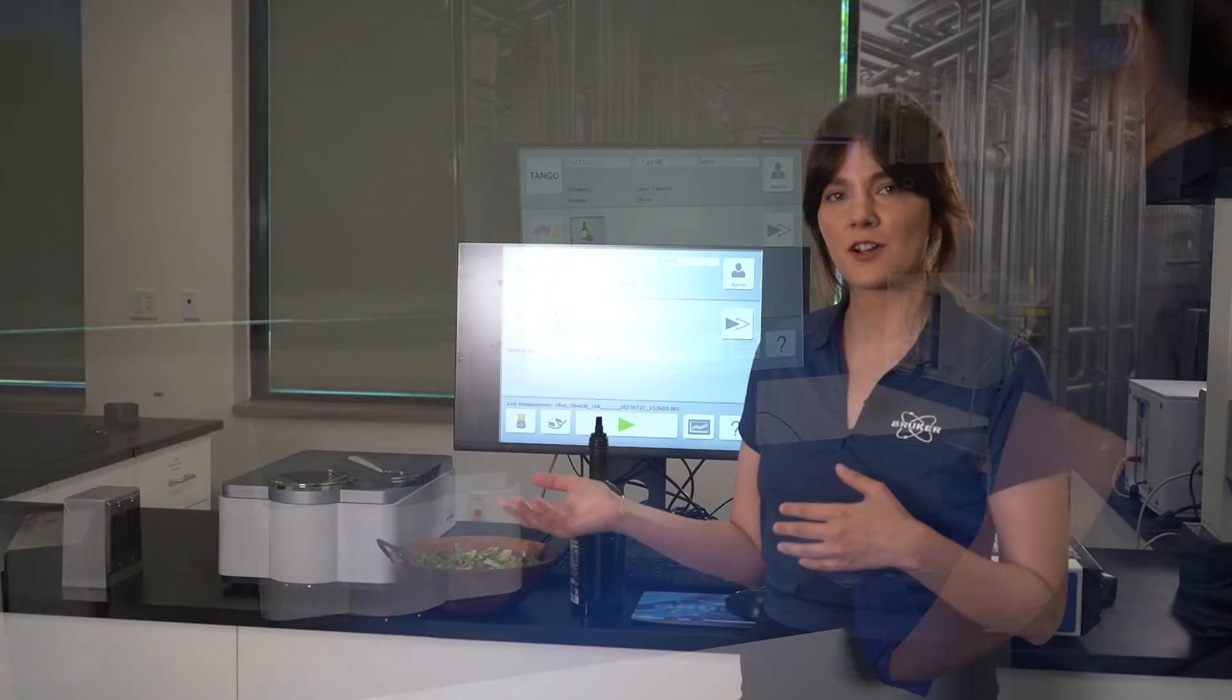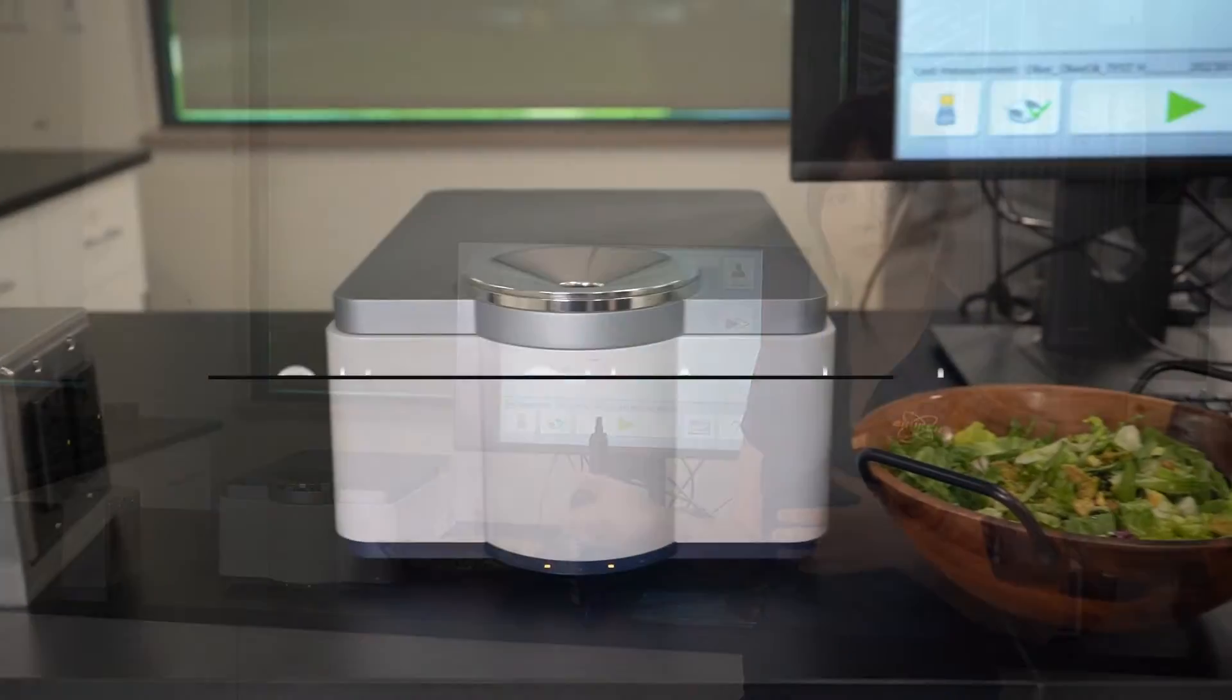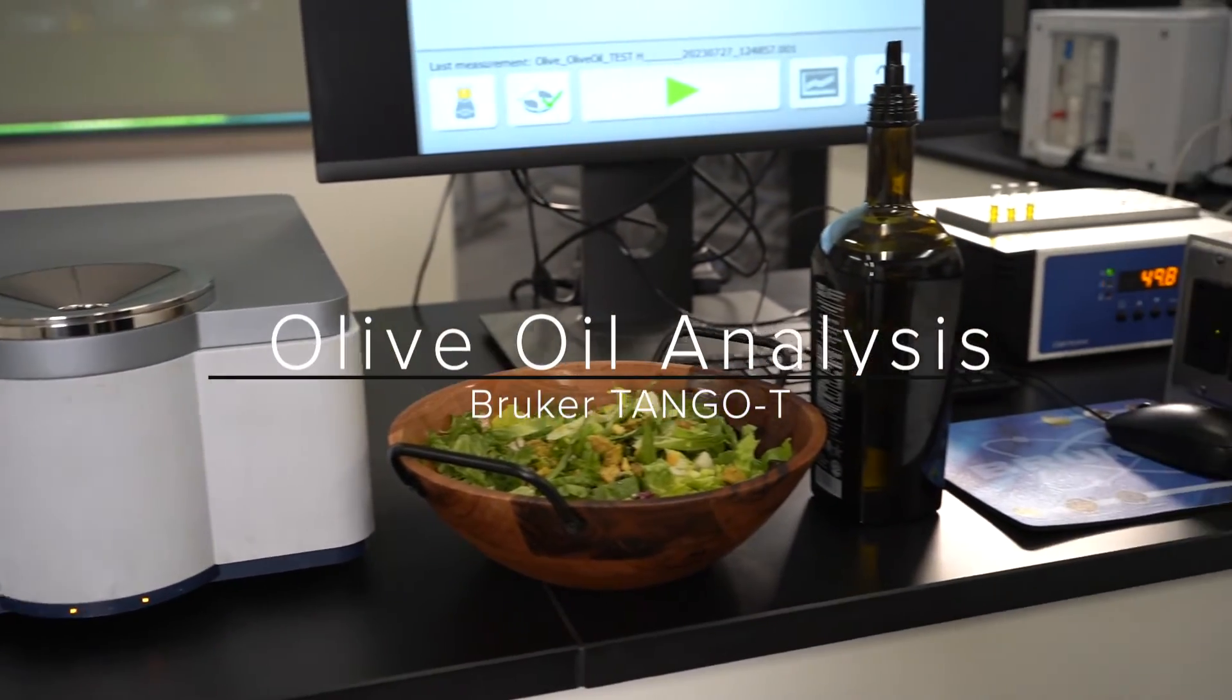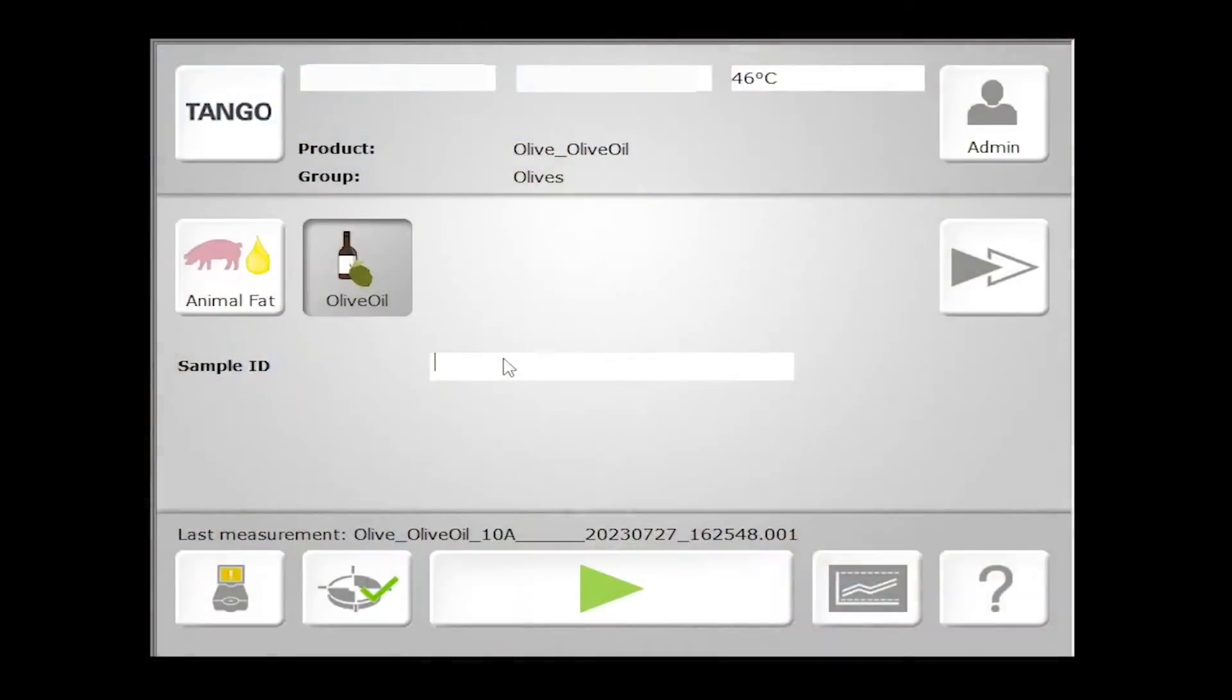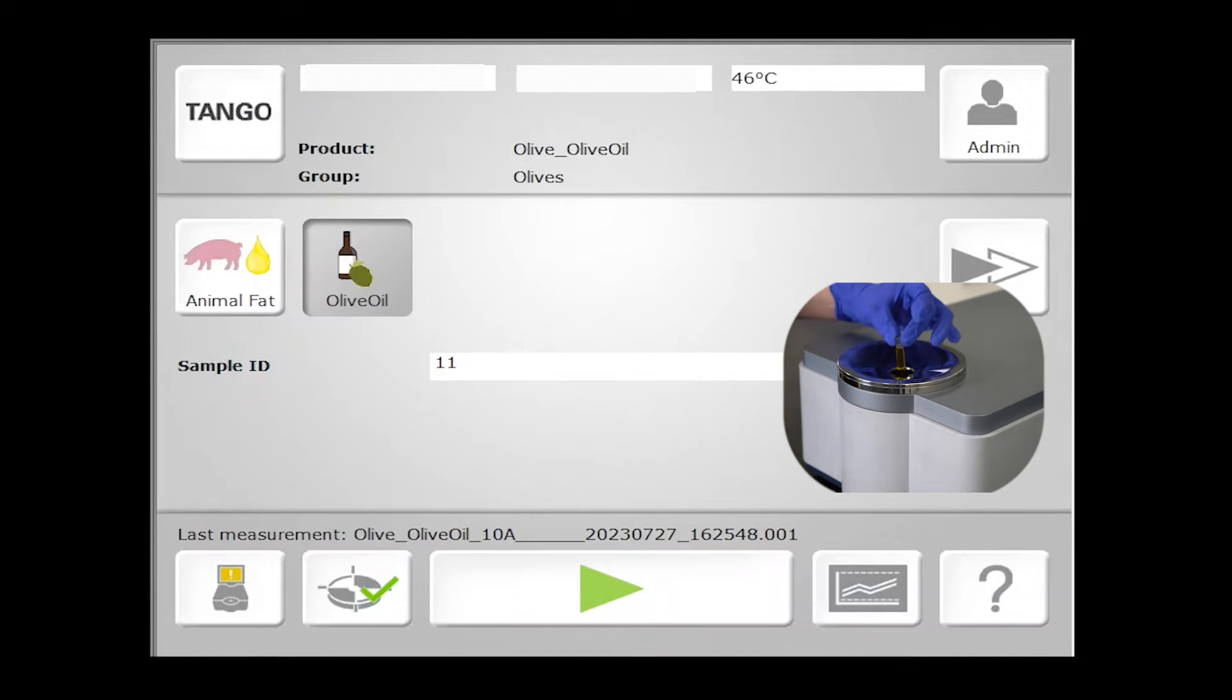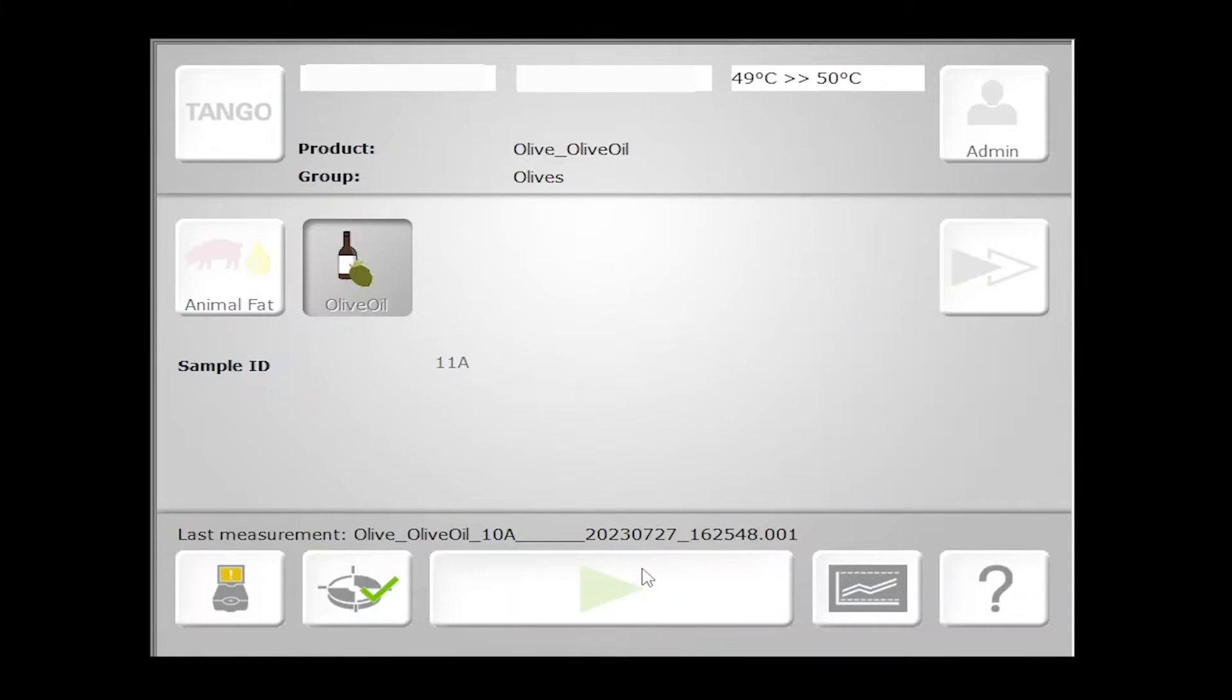So let's take our Tango T here for a test drive. Once our sample is placed in the sample compartment, we'll select our product in the Tango GUI, input any identifying information for that sample, and simply hit go.